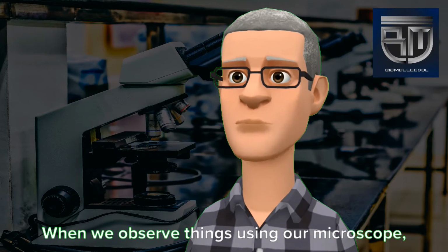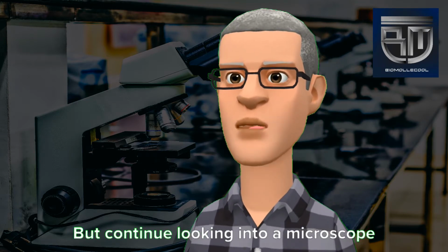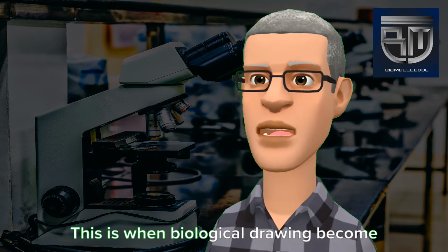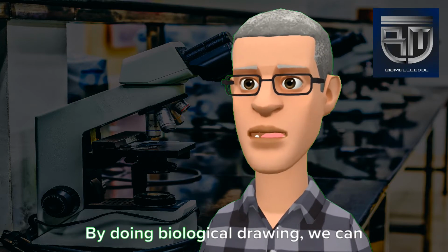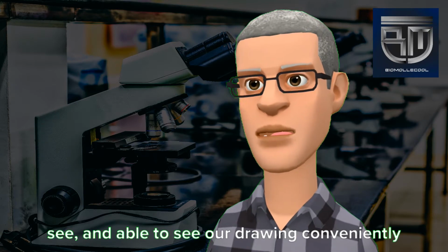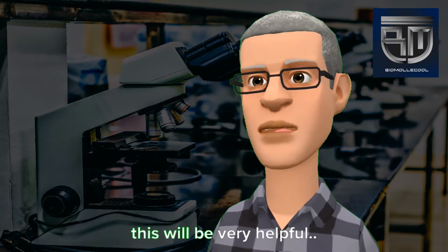When we observe things using our microscope, of course our objective is to study them, but continuing to look into a microscope could be exhausting. This is when biological drawing becomes an excellent alternative. By doing biological drawing, we can document the object, draw what we see, and be able to see our drawing conveniently anytime. This will be very helpful.